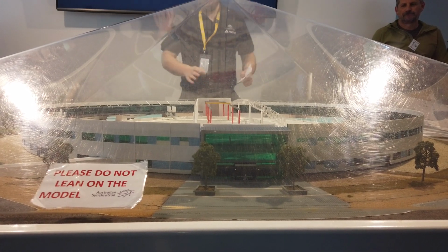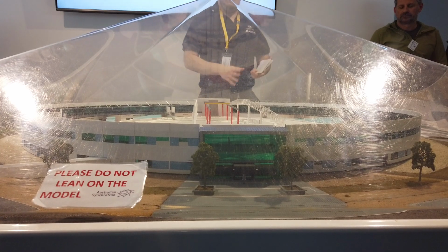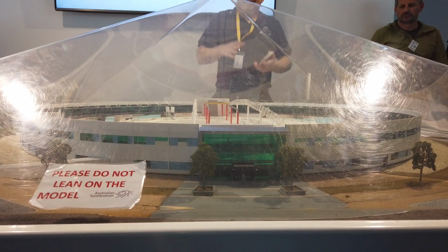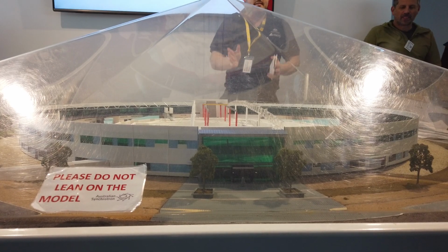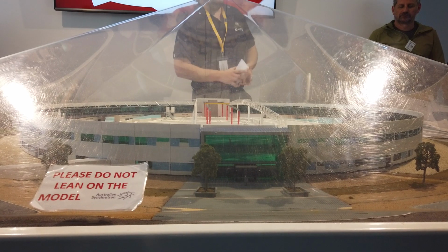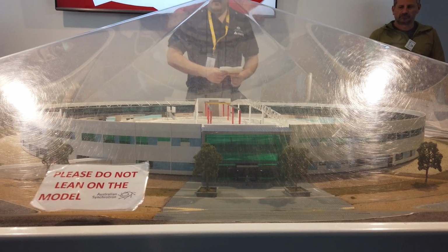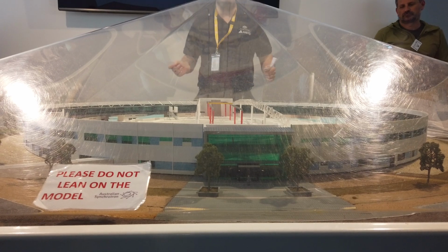One of the properties here is all of the light here from the synchrotron is collimated, meaning that it is all the same wavelength, the same phase, so that we get one type of light continuously. We're then able to focus that down into a small beam of approximately 2 microns in size. Okay, does anybody have any questions while we're here about the synchrotron, how it functions?